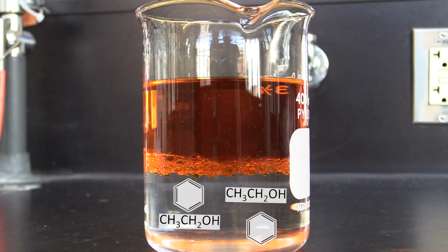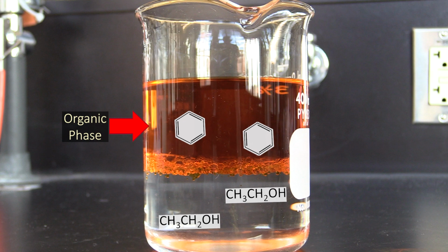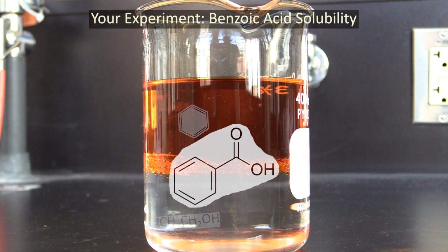Since benzene is more soluble in organic solvents than it is in water, it would migrate to the organic solvent, or organic phase, and therefore remove itself from the water, which we also call the aqueous phase. However, since ethanol is more soluble in water, it would stay behind in the aqueous phase. This experiment will be a variation on this theme.